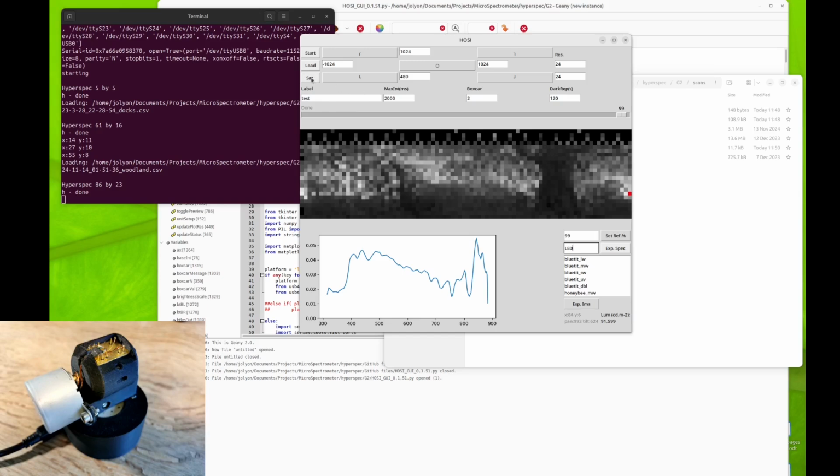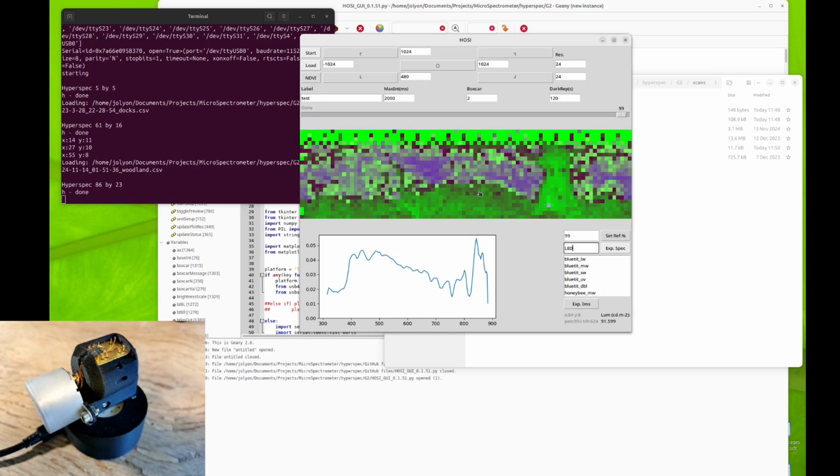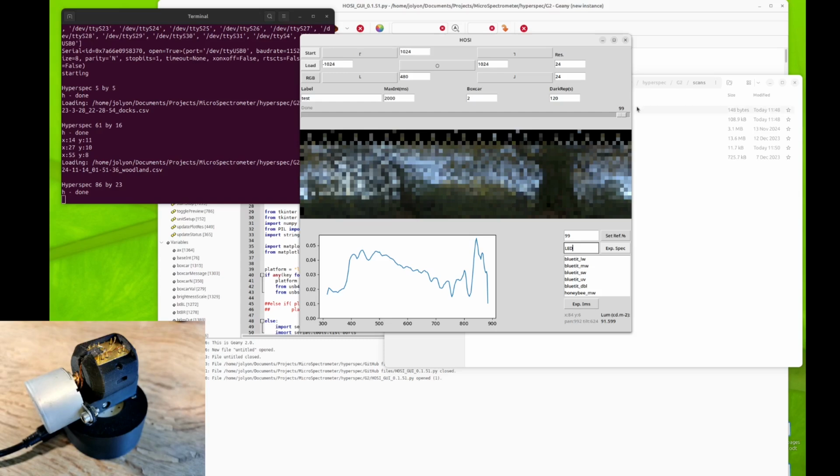Okay, so next we can put this into a different mode. This is IGU, so this is showing us an extended spectral range, infrared, green and ultraviolet in place of red, green and blue. And we can also change this to NDVI, so this gives us an NDVI index score for each pixel. Or back then to RGB.